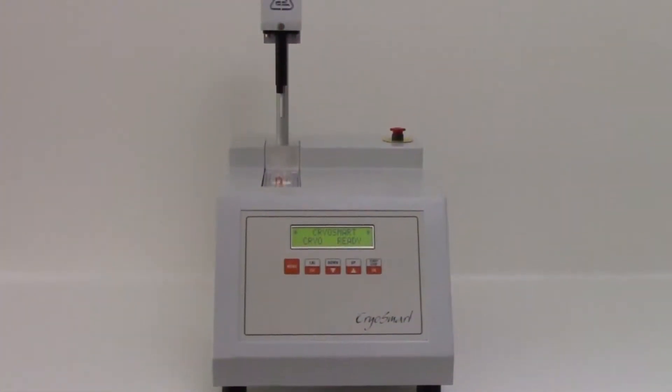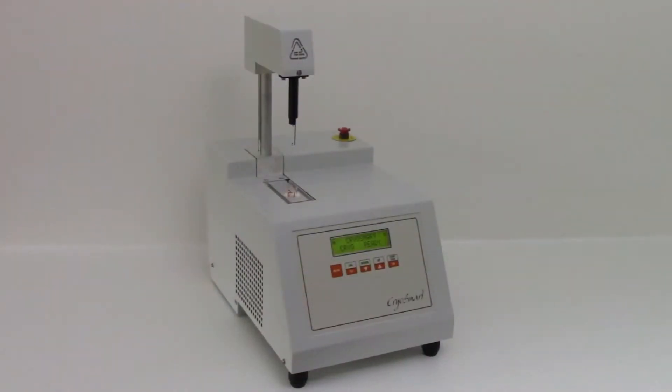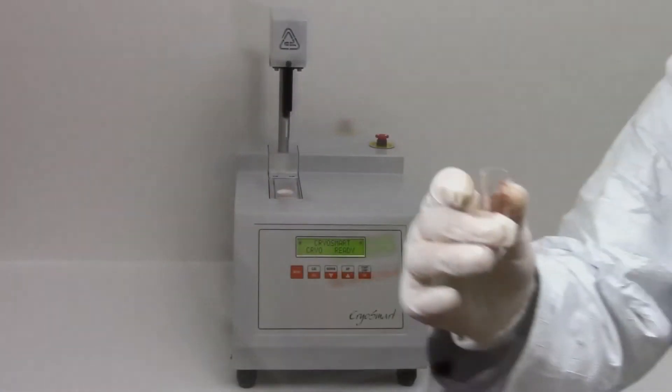Astori's Cryosmart 1 cryoscope has been realized for the determination of the cryoscopic point in milk due to added water. Cryosmart 1 is very easy to use and can get results in 2 minutes only.